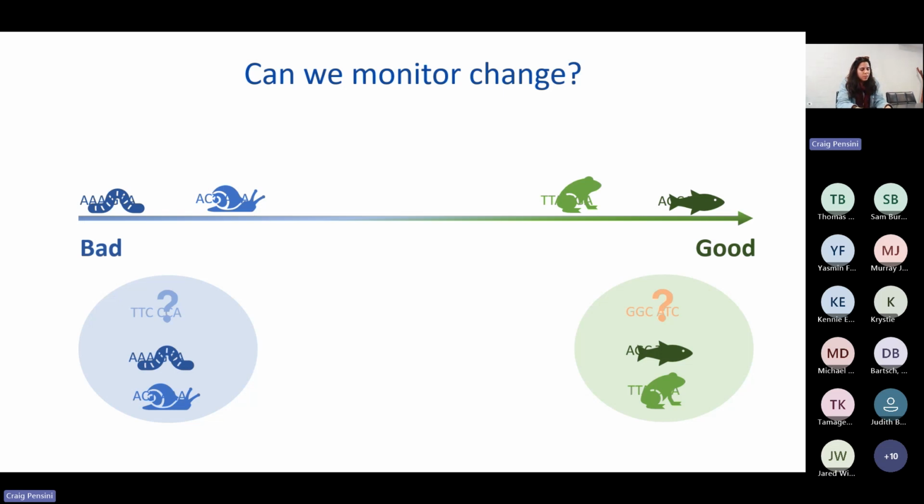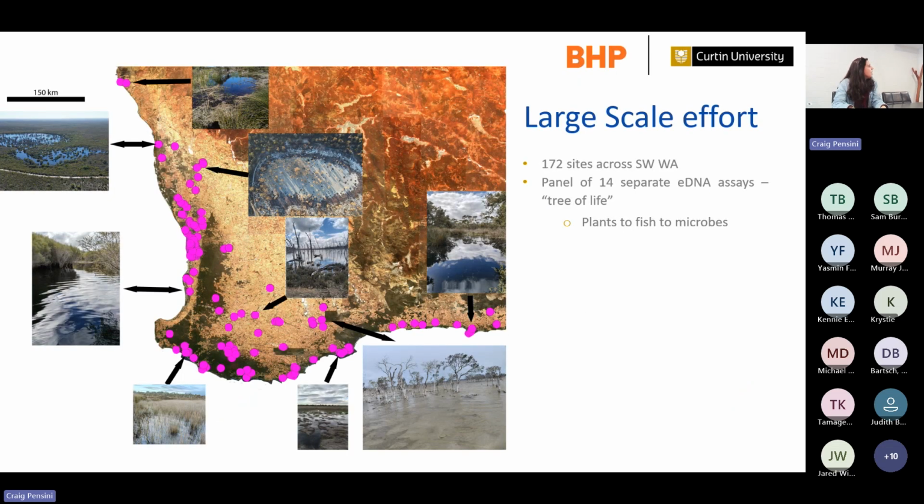But when we talk about eDNA, we don't need to look necessarily at species. We can look at sequences. And one thing is that a lot of sequences are not in the database, especially for the little things. So the idea was that we could use eDNA to have those indicator sequences, but not attached to a specific group or specific species. So that's the idea, that we are going to move from species to sequences.